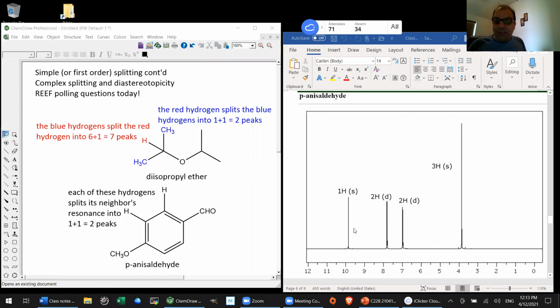It could be that the person that set up the instrument to take the spectrum was in a bit of a rush, or it could also be that no matter what he did, it was going to come out a bit crappy looking. But in general, when you see peaks that are that small in comparison to the main peaks, that's how you know that you can ignore them. When they're really, really tiny, here's another really tiny one over here. So I have been known to put little X's over peaks that you should ignore. I've even been known, I'm not too proud to do this, to take the spectrum into the GIMP or another paint program and white out these little ones that I don't want you to look at so you don't get distracted. I am not too proud to do that, and if necessary, I will feel perfectly free to do that again.